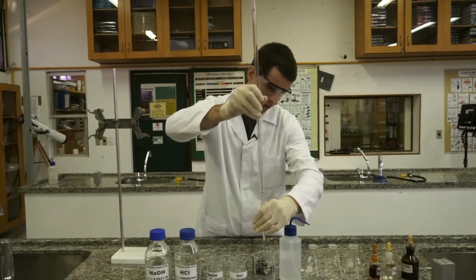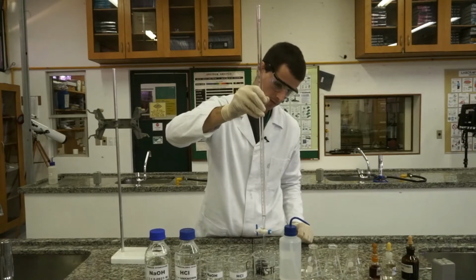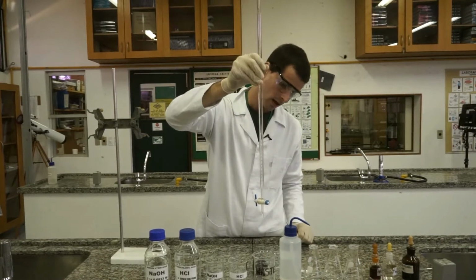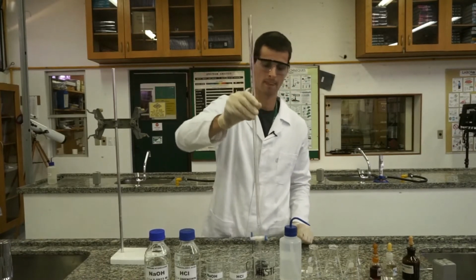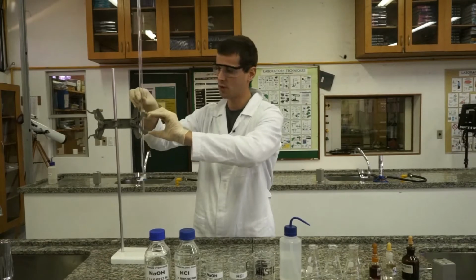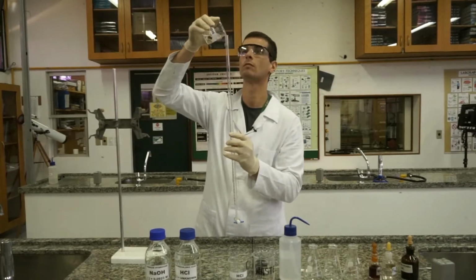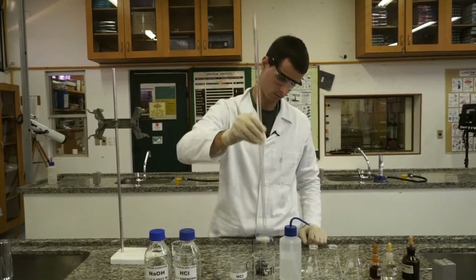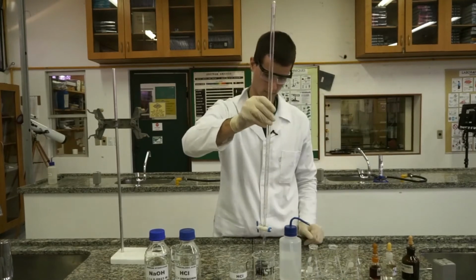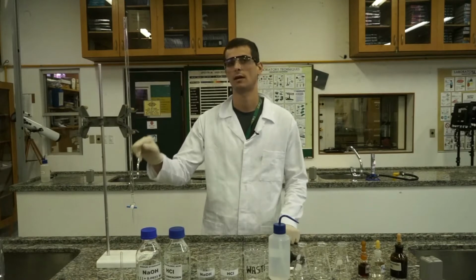Drain it out. I will make sure that my burette will be clean. I'm going to refill the burette with sodium hydroxide, with the TITRANT, and repeat this process 2 more times. It's a good laboratory practice to rinse the burette thoroughly with the TITRANT. Now my burette is clean and I know that it has only sodium hydroxide in here.